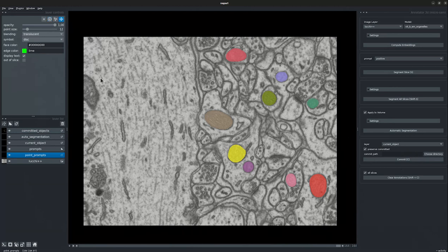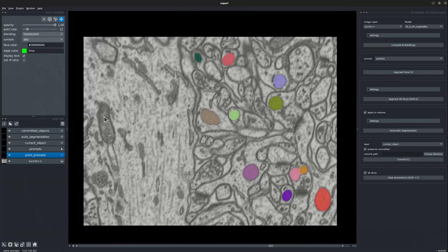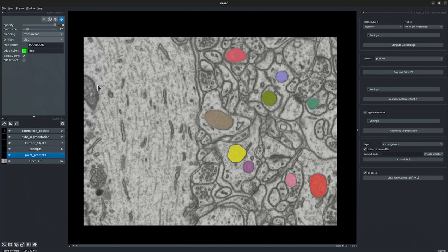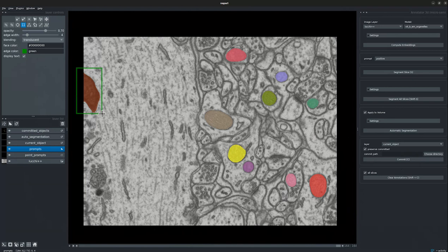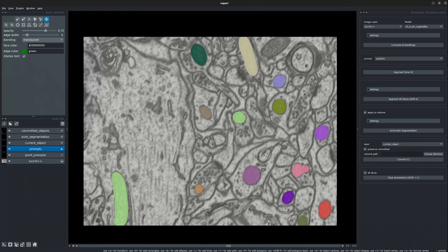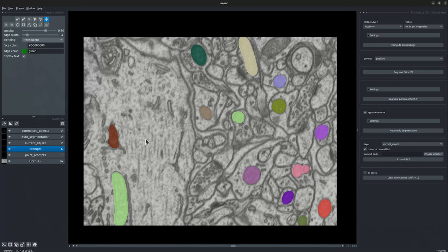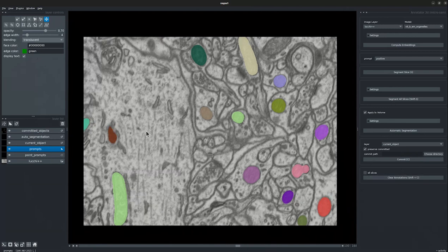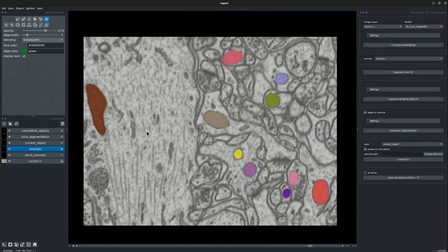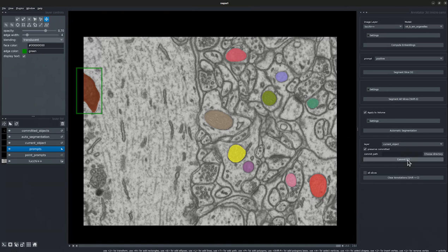Now let's go ahead and segment another object. We use box prompts for this object. This has been segmented in the current frame. Let's go ahead and see how the segmentation looks for consecutive frames. We see that the object has been segmented along all the respective slices as desired. There are however some incorrect projected segmentations. Let's go ahead and clear those segmentations from the respective slices. And there we have the object segmented along the z-axis. Now let's commit this currently segmented object.